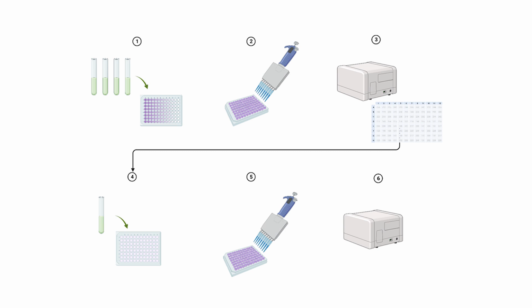In the second part, we will further dilute the extract with the highest antioxidant activity, perform the DPPH test again, and evaluate the antioxidant activity relative to gallic acid, that is, GAE, gallic acid equivalent.